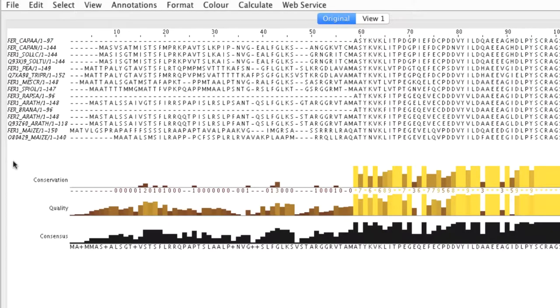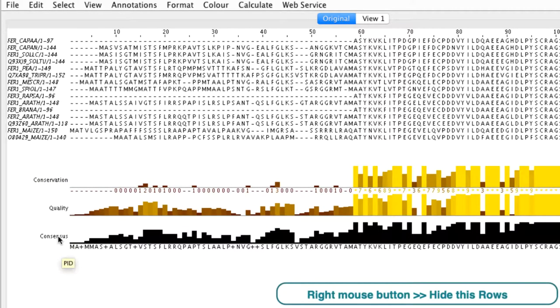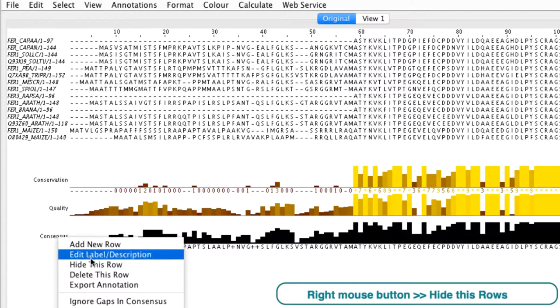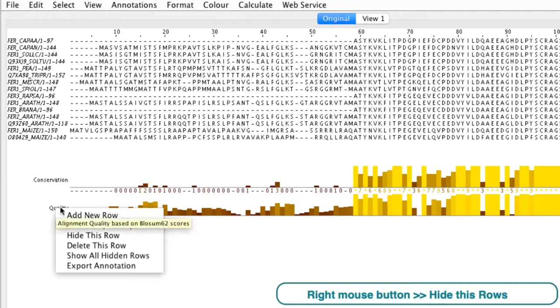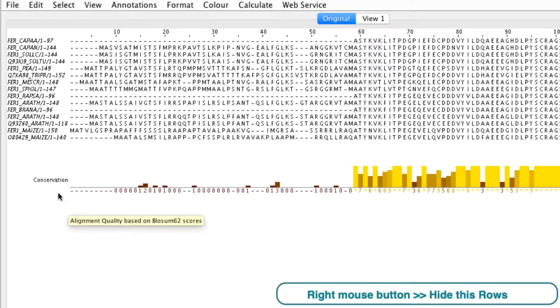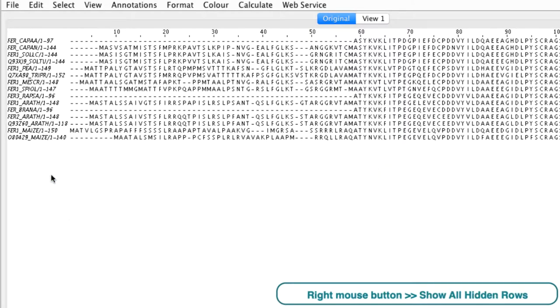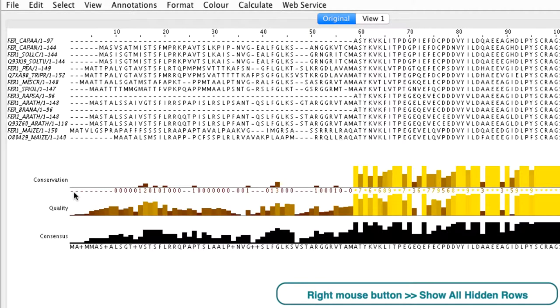Individual annotation lines can be hidden by placing the cursor on the annotation in the labels panel and then right clicking the mouse. This opens a context menu and then I select hide this row. The annotations can be revealed in a similar way, but this time I select the reveal all hidden rows option.